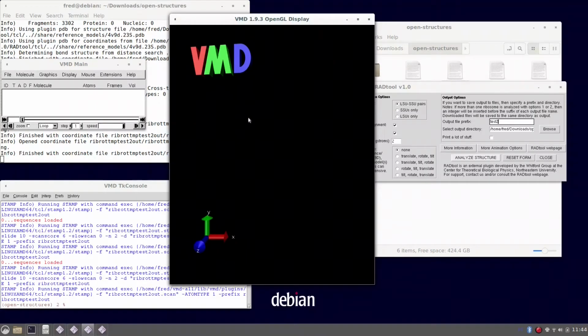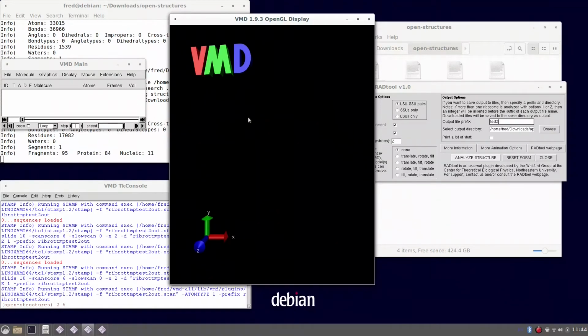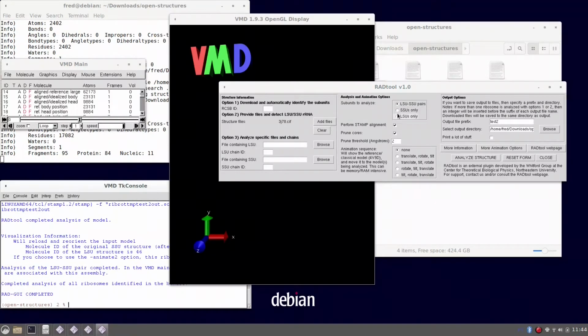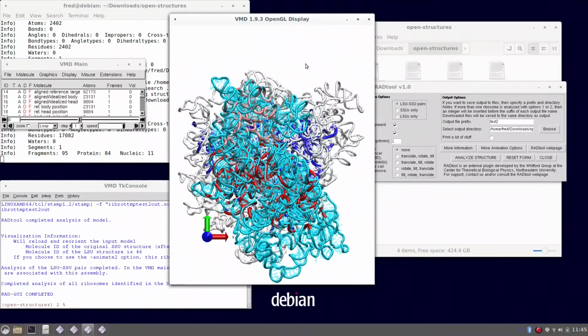And as it's ending, in the main menu you can also switch on and off everything. In this case, it's nice to point that we are analyzing the whole ribosome, but you can also analyze separated large and small subunits by selecting these options. So yeah, here is the structure that we are analyzing alongside the reference.